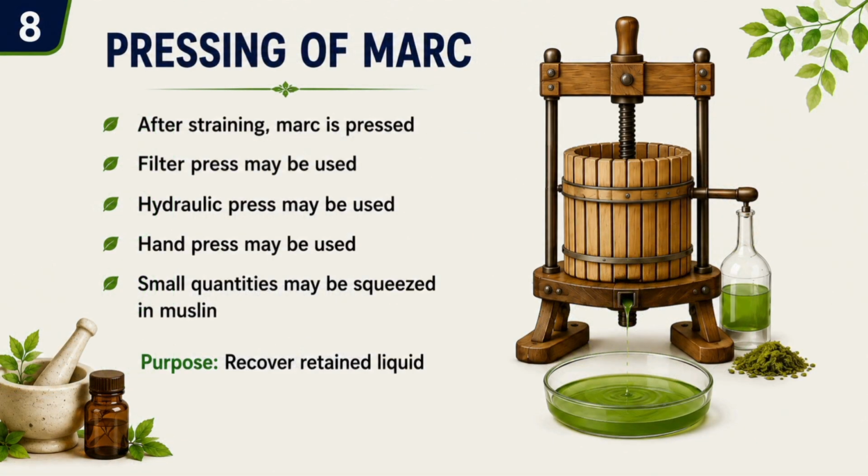Pressing of marc. After straining, some valuable liquid remains trapped inside the marc. So should we throw the marc away immediately? No. The marc is pressed to recover the retained liquid. A filter press, a hydraulic press or a hand press may be used.